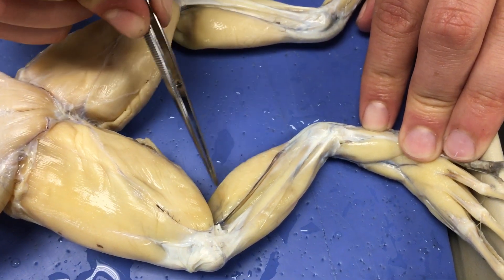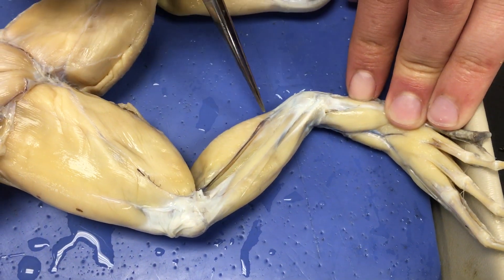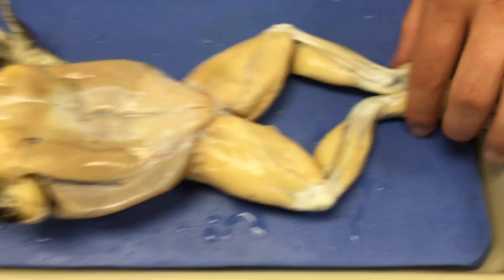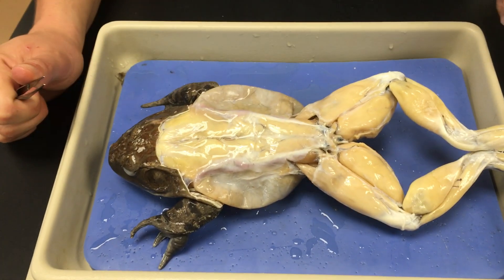The gastrocnemius — I know it's a weird-looking word, but just say gastrocnemius; the C is silent — and it's anchored by the Achilles tendon. That concludes the external and muscular anatomy of the frog.